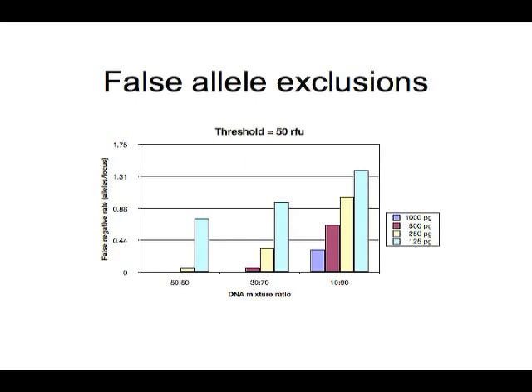So this is a study that we did. In fact, Kara Spencer, along with my compatriots Jessica Staub, as she was called at the time, and Erin Churro, she was married, at Cybergenetics, we, in triplicate, examined a host of data that's described in our 2009 paper, An Information Gap. And what we did is we, in triplicate, applied thresholds to synthesized mixtures that were made from a pair of NIST samples that were provided to us by NIST. And we knew what the correct alleles were.